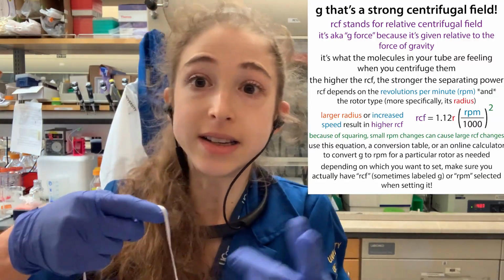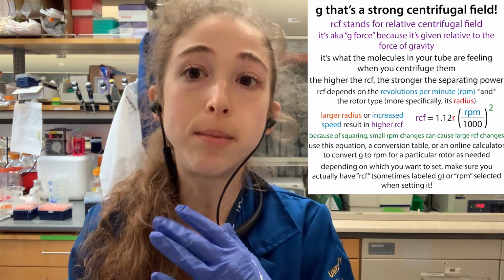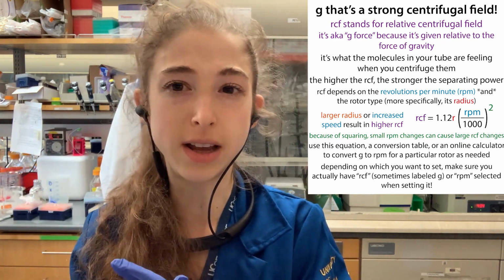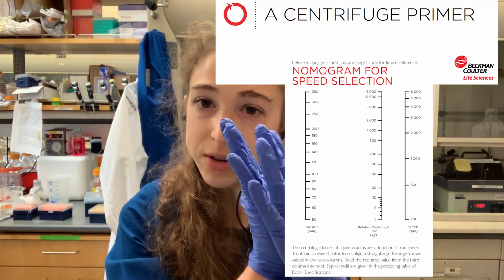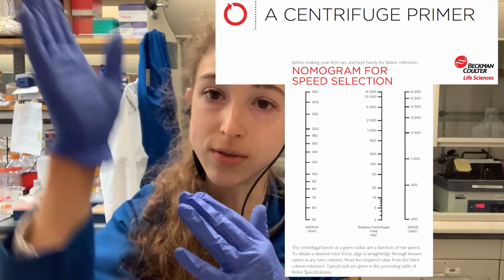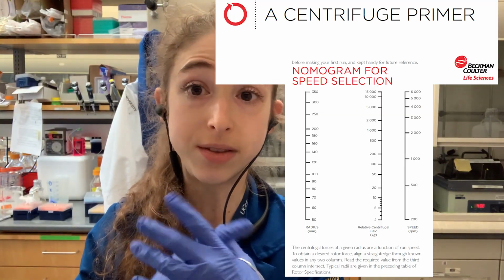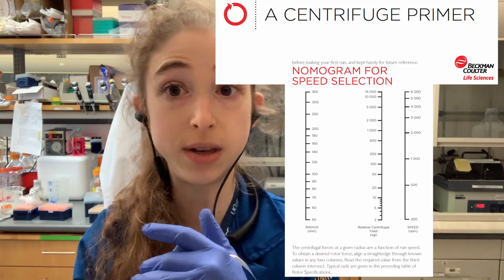But the basic idea is that once you know one of these, then you can convert between the two. There are online calculators that you can use. There's also this thing called a nomograph, where you take the two things that you do know and you draw a line through them, and it'll direct you to the third thing that you don't know. Whether that's the radius, the speed in RPM, or the speed in RCF.